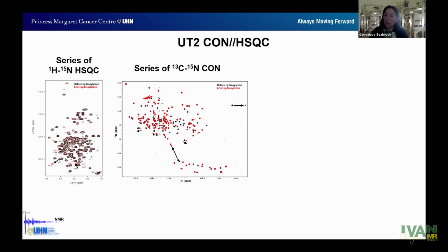Yeah. What is the question? Oh, you're saying, I think the hydroxylation happens at the C gamma position, right? The proline, yeah. You did the side chain experiment, side chain detection. Do you have better sensitivity to this hydroxylation step when you look at the C gamma or maybe C delta rather than carbonyl? No, the carbonyl were much better. Works much better.